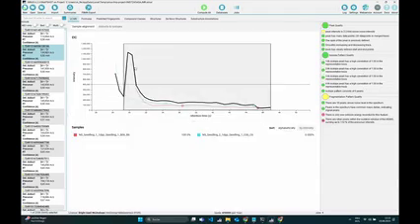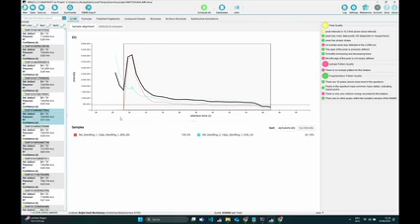You always have some features which have a high quality, and this can already give you some overview before you start computing stuff, because if you have features which have just low quality, maybe you don't have any peaks in your data, it also doesn't make too much sense to compute something for it. Okay, just to explain this a little bit, you can see here the chromatogram. What you can also see, if I move through this list a little bit, we just dropped in 2 mzML files. And you can see now here the intensity of the feature in the 2 different files. So again, we aligned them doing preprocessing.